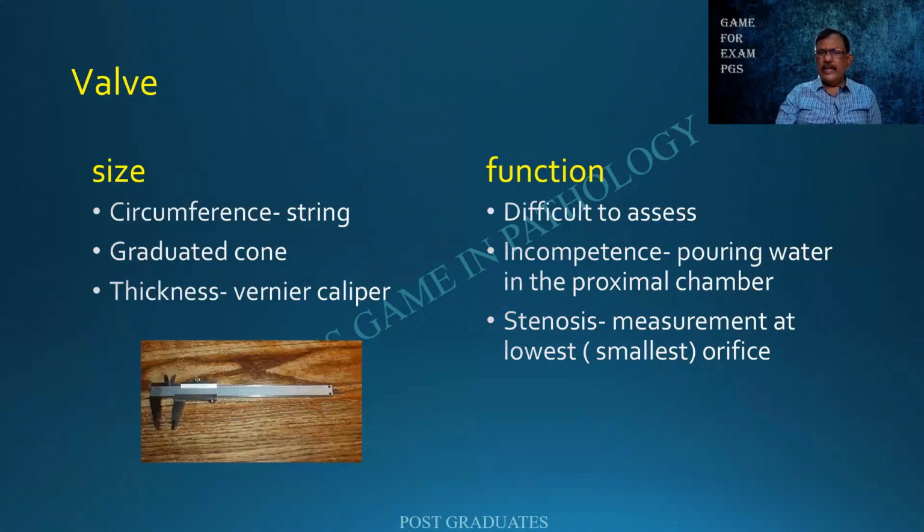And coming to the valves as such, measurement of the heart is one, measurement of the valve is another. A common question that is asked, and even otherwise it is common sense for us: how do you measure? It can be done by means of a string. You don't have any instrument in your center, just a piece of string around the valve. You will be able to get the circumference. Otherwise, there can be a graduated cone. As it goes deeper, according to the graduation, you will be able to make the measurement.